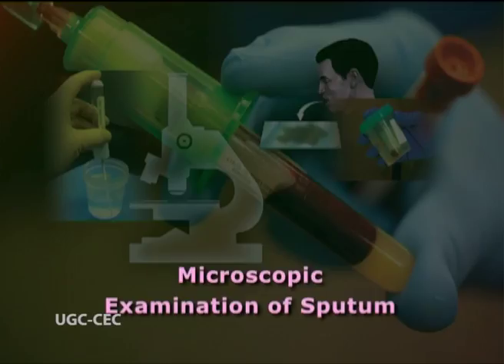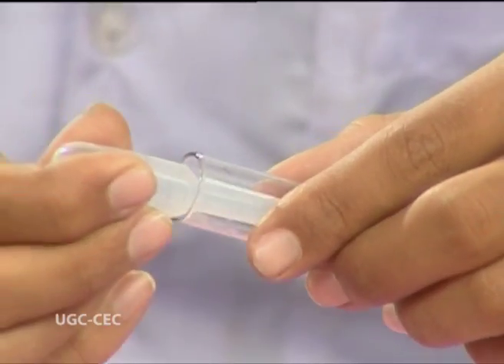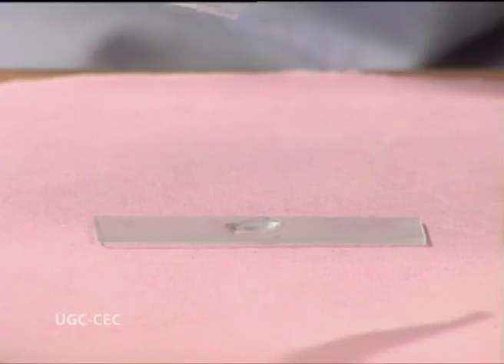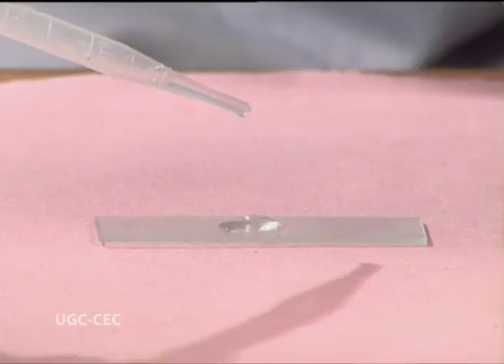Microscopic examination of sputum. An adequate amount of sputum sample is collected in a test tube. A drop of it is poured onto a glass slide.